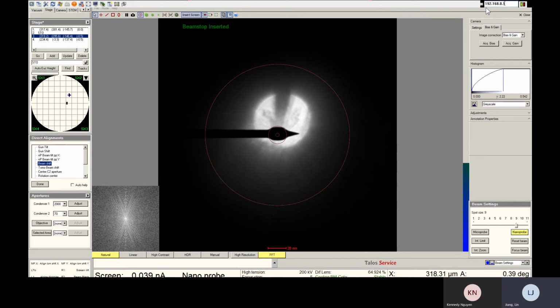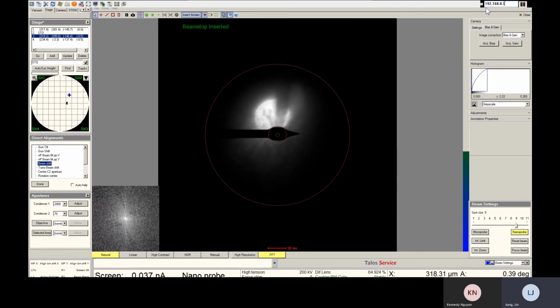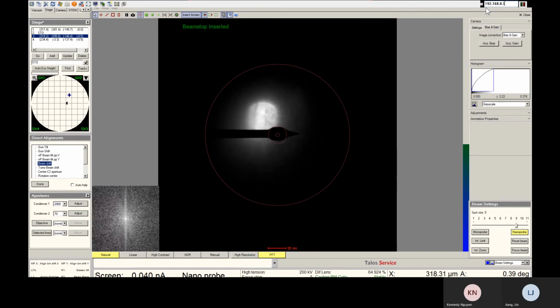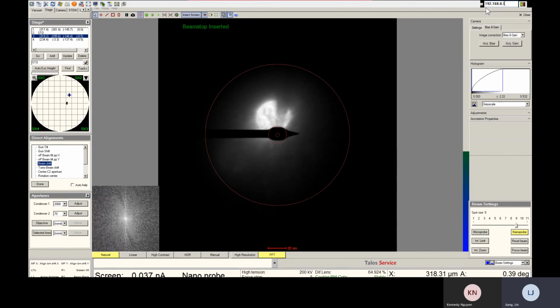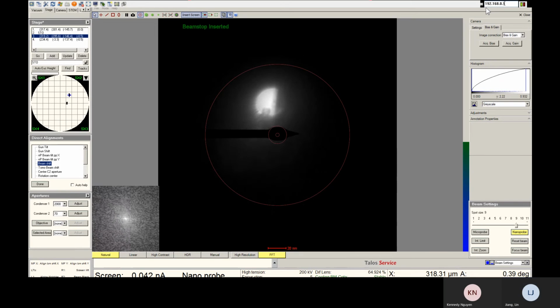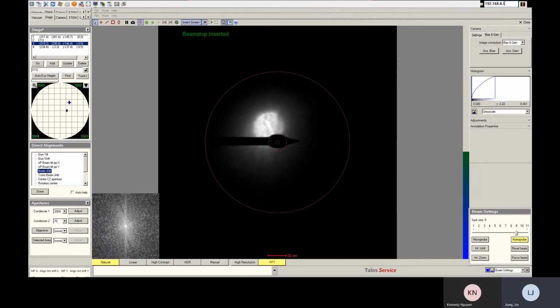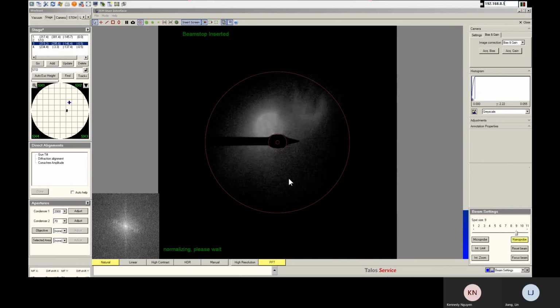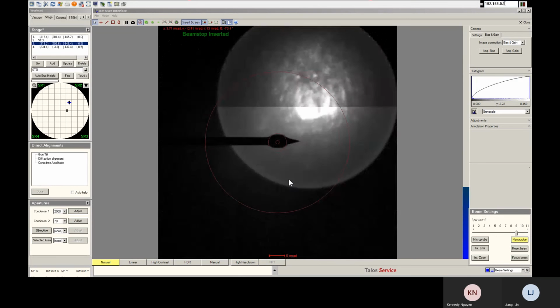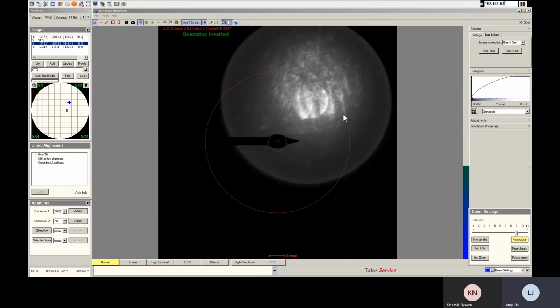And then you condense the beam a little more. So this is, I just select half of the particle. Just select half of them. And then again, you do fine focusing.